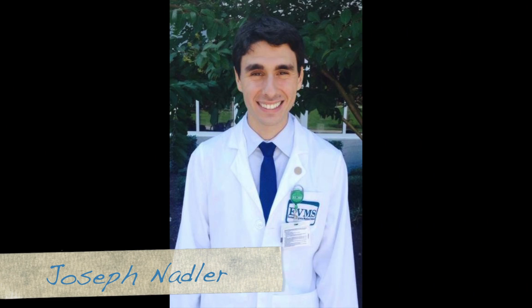Hi, welcome to the 15th episode of Histo Helpers. My name is Joseph Nadler, and I'm here to walk you through the urinary system.